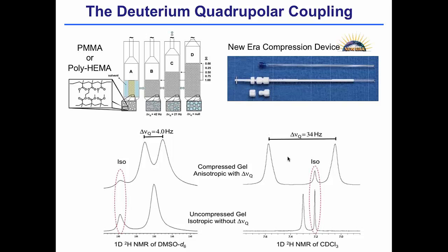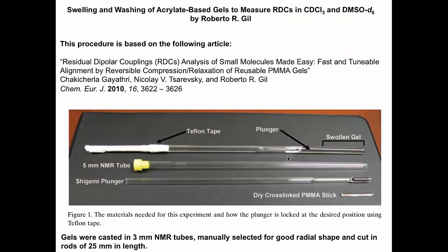So here are the tricks. The PMMA gels are very brittle. And one of the problems that we initially faced, and many of my colleagues faced, is that once the gels are made and then dry, they are very brittle, and they like chloroform a lot. Well, they start cracking, and there's a way to avoid that.